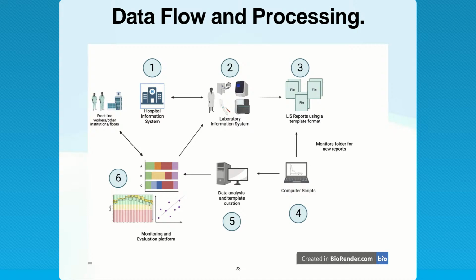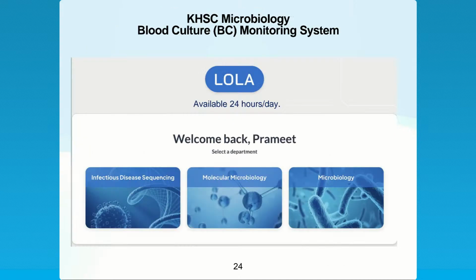Okay. And so we developed this thing that we called LOLA. It's Lab Organizational Laboratory Analytics, or Live Analytics. Sorry, I always get that wrong. We developed this for KHSC Microbiology. And so we had 3 things. Number 1, you actually register for this account and it's personal. So when I log in, it says, welcome back, Prameet. Select a department you want to go to.